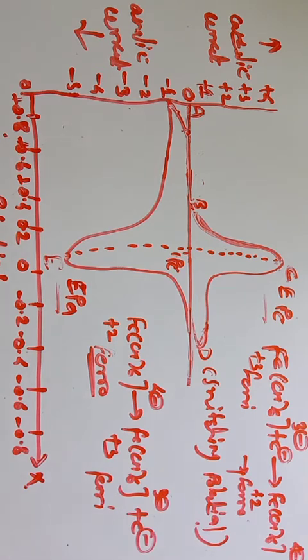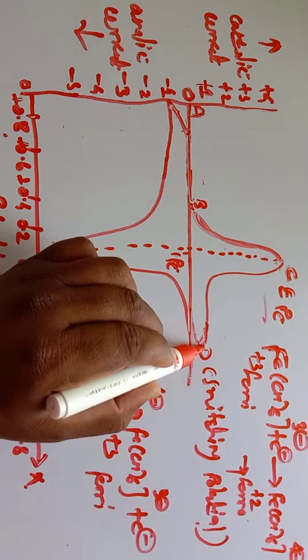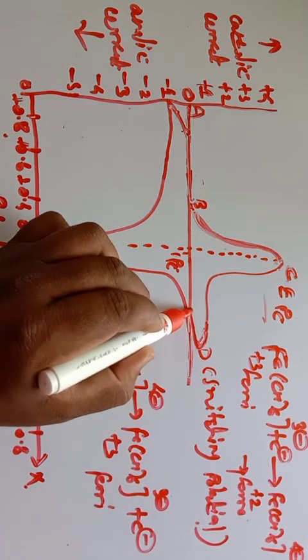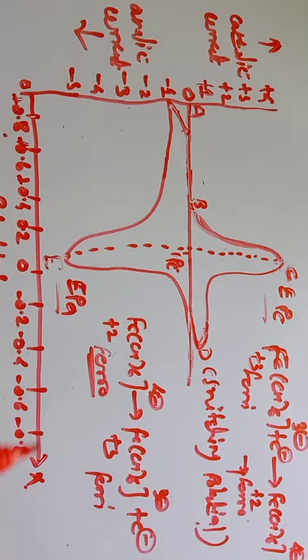As the potential is swept in the positive direction, from more negative to positive, the current goes to zero and then becomes anodic. So up to this point, when we switch the potential, it is slightly cathodic, reaches zero, and then is converted into anodic current.